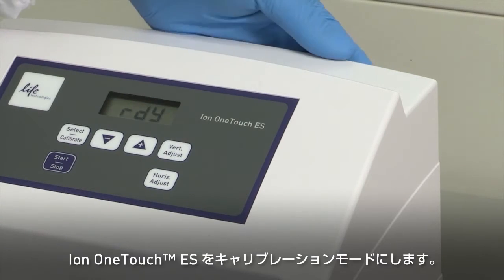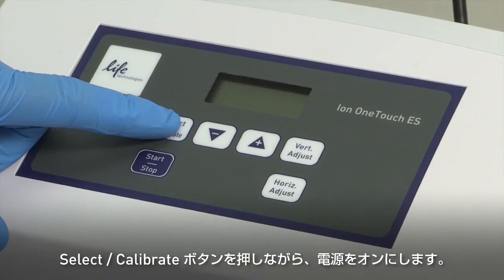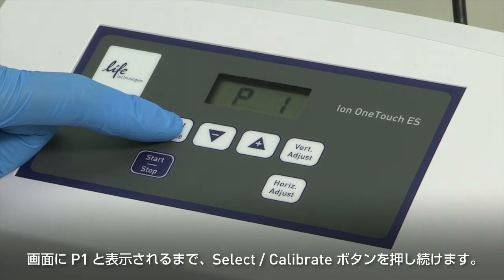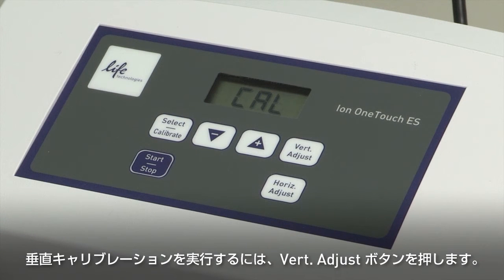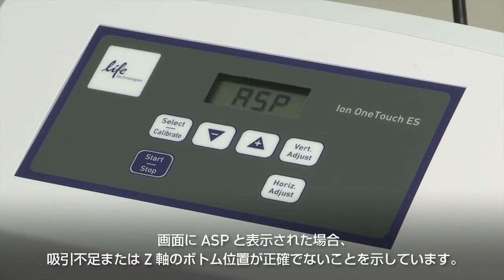Put the instrument into calibration mode. Power the instrument off. While holding down Select Calibrate, power the instrument on. Keep holding down Select Calibrate until P1 is displayed — the instrument will cycle through several values. Keep holding the Select Calibrate button for three seconds until the instrument beeps two times and Cal is displayed. To perform vertical calibration of the instrument, press the Vertical Adjust button. The ES instrument displays ASP, which is short for Aspirate or Z-bottom position.